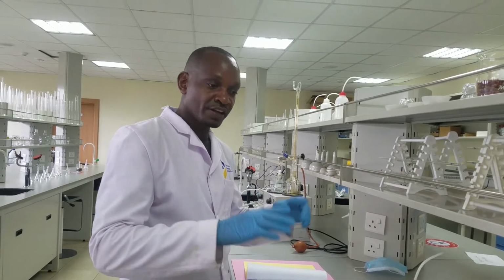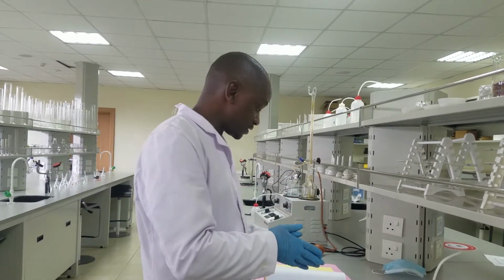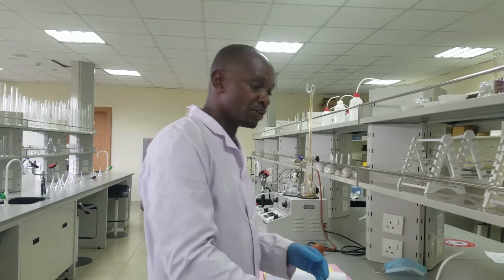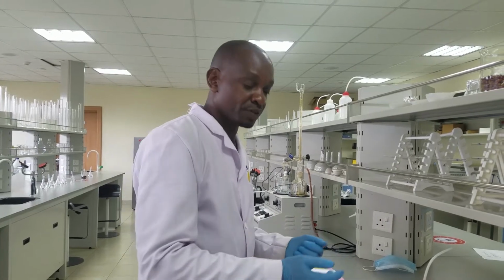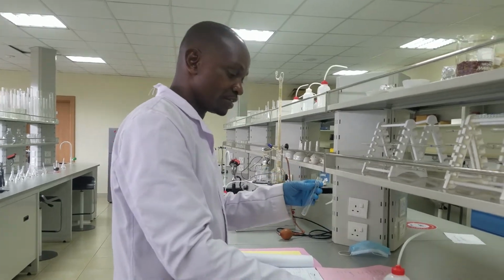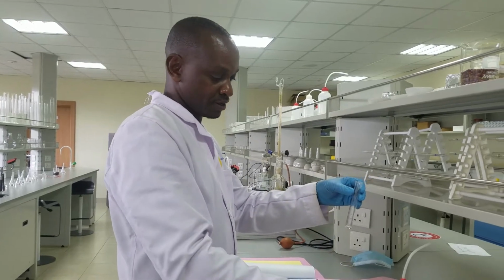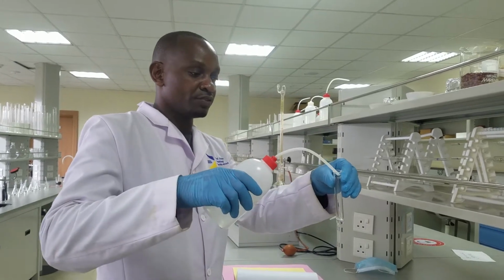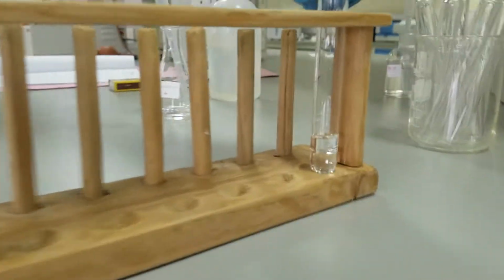Now we have finished with the knowns. We have done combustion, we have done solubility in water, solubility in DCM, and now we want to see the unknown. From the unknown, you will tell us which one of the two it can identify with. I will start with the first reaction, which is solubility in water again. So I'll pick my unknown like this. And I told you that the unknown is one of the two reagents that we have given you. So we'll put in water like that, and we'll leave it to settle.